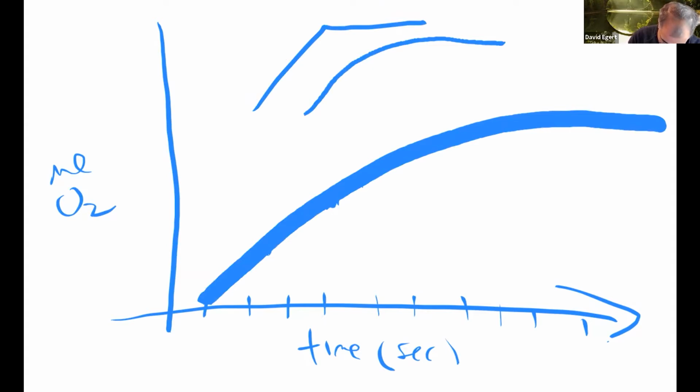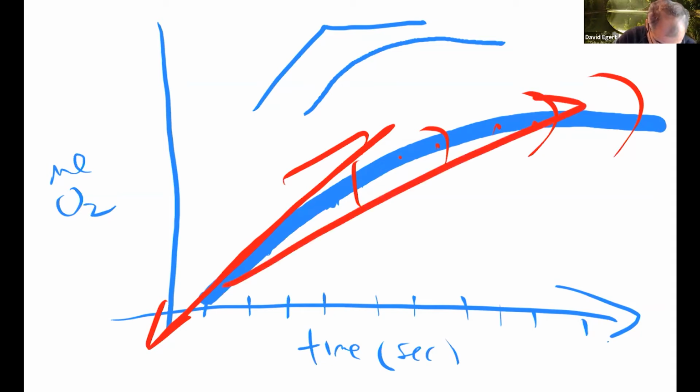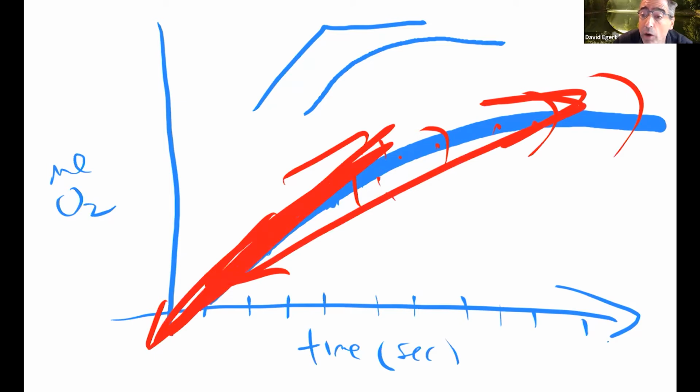What this means is my best fit line is probably around here. This place where it's starting to lose steam, I don't care about that anymore. This is usually from 35, 40 seconds on. Even if it's still going, it's in the process of slowing down. So that is not the place I want to consider for my best fit line. I do not want to draw my best fit line like this. It's going to be when the thing is really going.